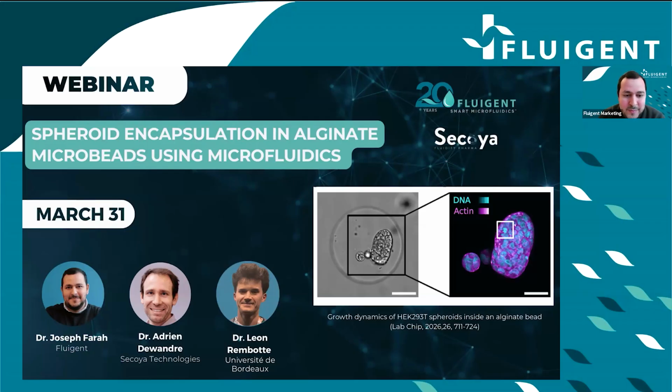Adrien will first present the technology, and afterwards Léon will present how to encapsulate: first, how to generate the alginate beads, and afterwards how to encapsulate the spheroids using the microfluidic techniques that we would like to present. Adrien, the floor is yours.